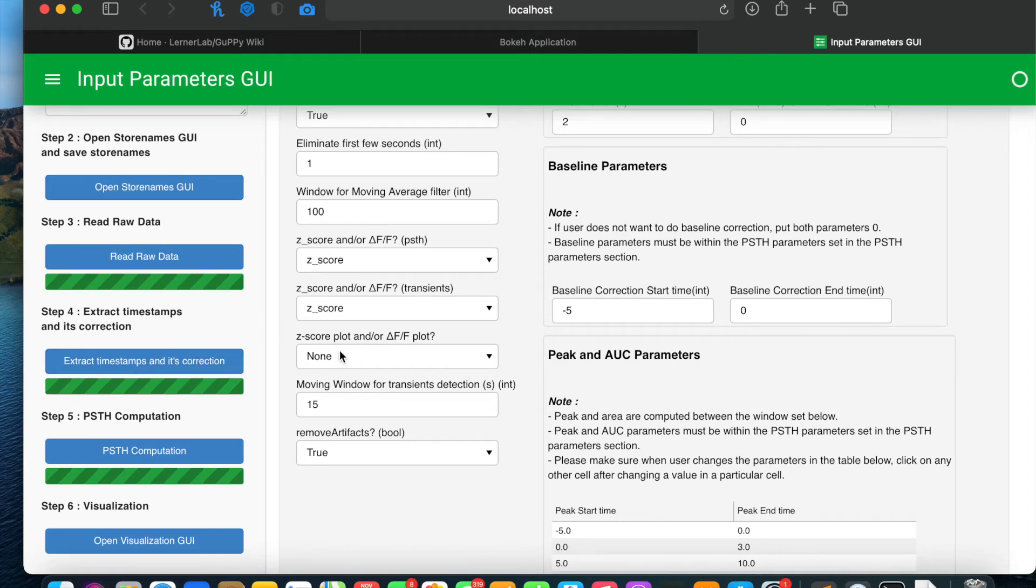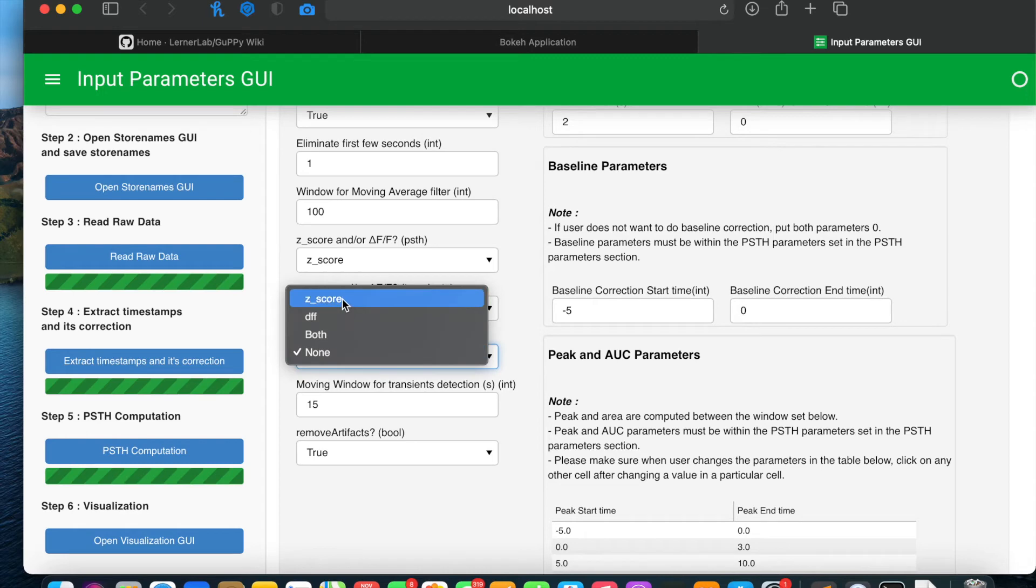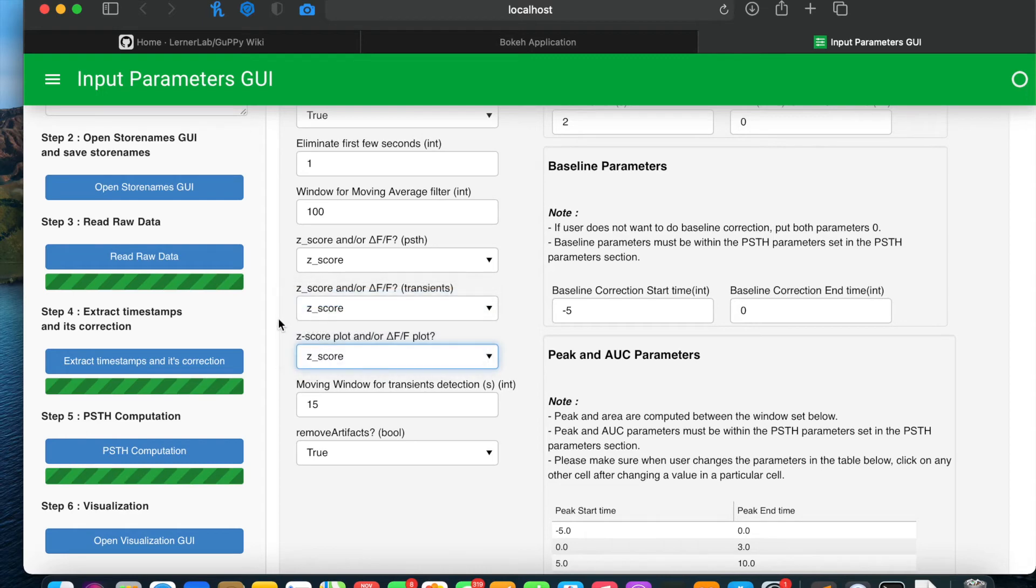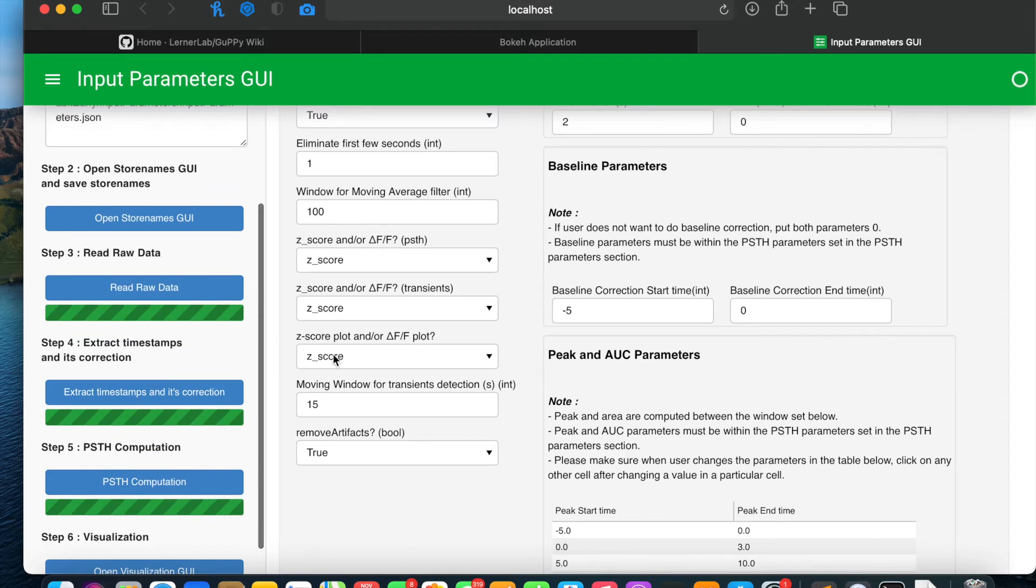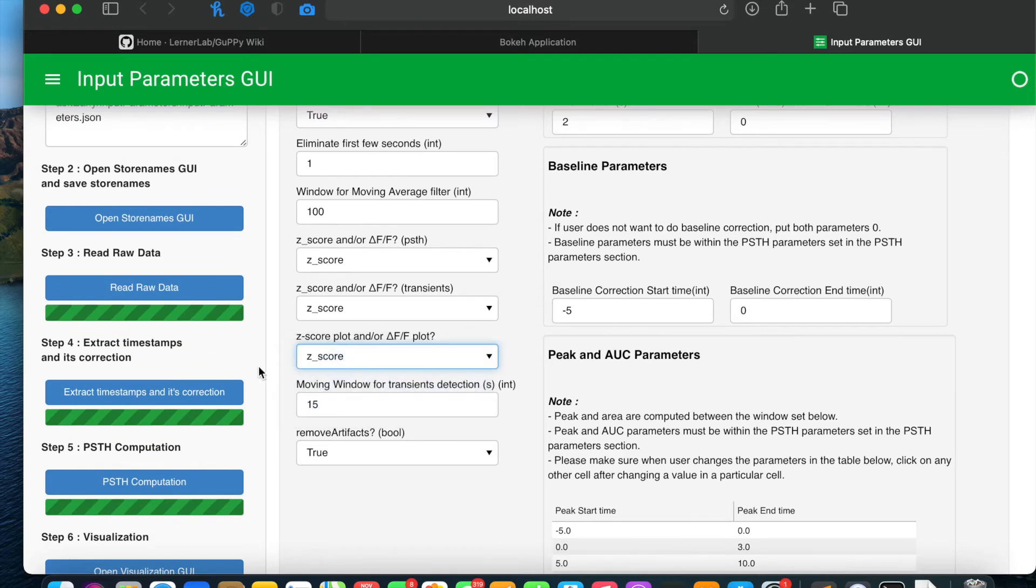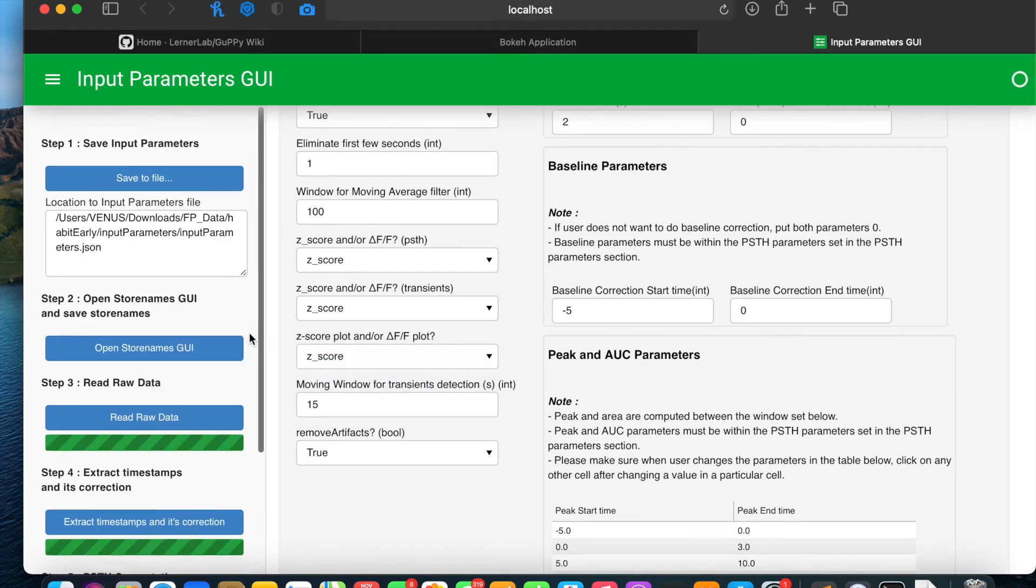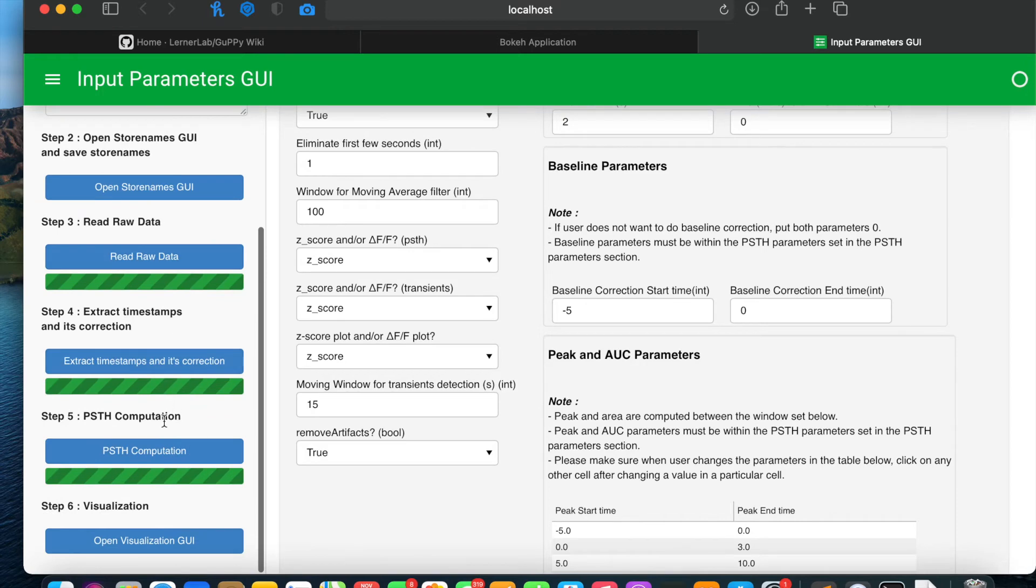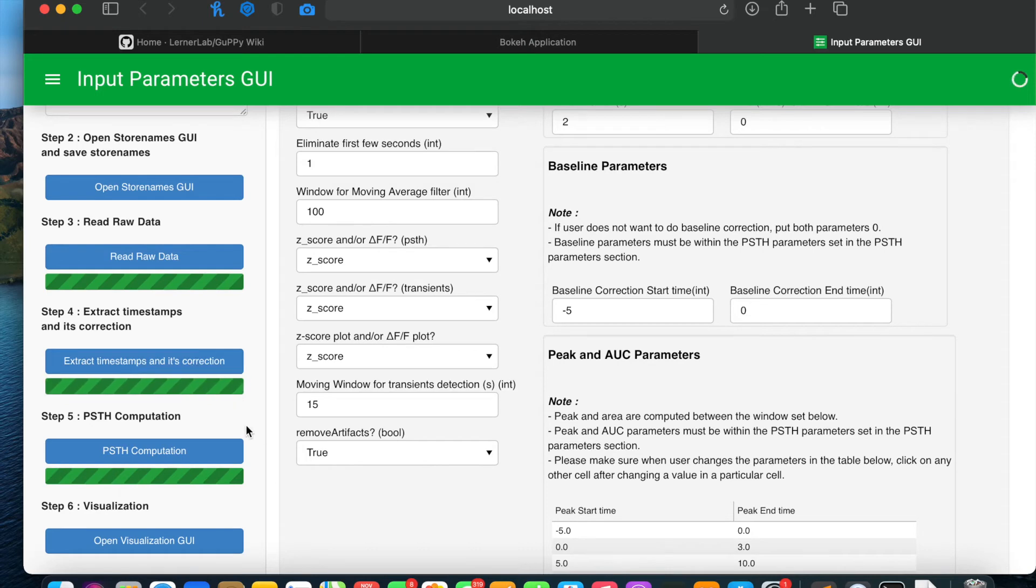We will also plot the z-score to see how artifact removal thing worked. I will select z-score for the plot, save it to a file, also make remove artifact parameter true and run step 4 again.